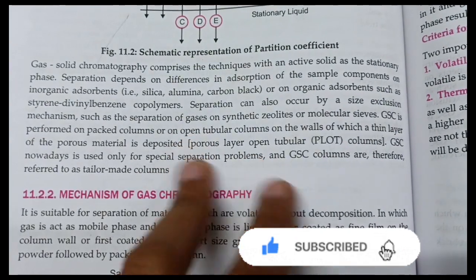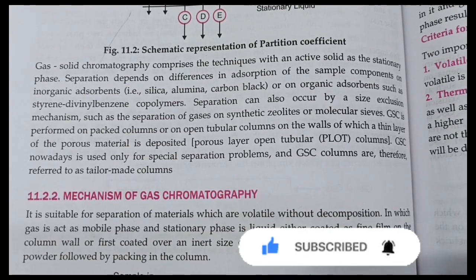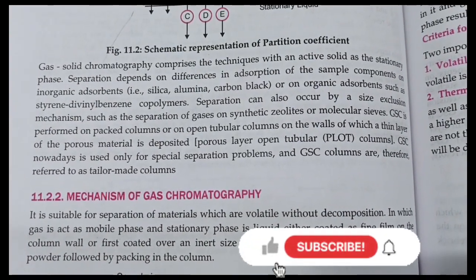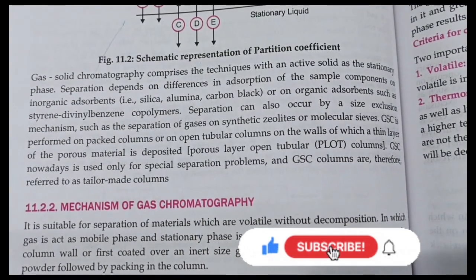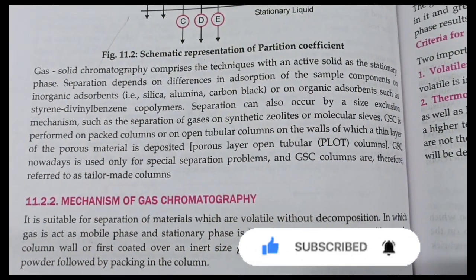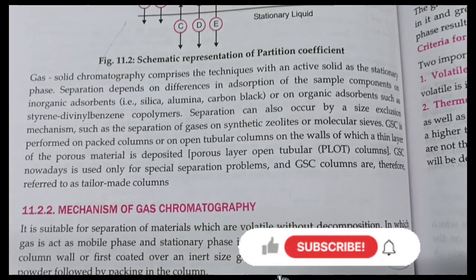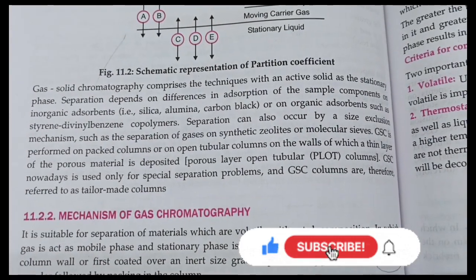Gas solid chromatography is performed on a packed column or an open tubular column, on the wall of which a thin layer of porous material is deposited. Nowadays gas solid chromatography is used only for special separation problems. The gas solid columns are therefore referred to as tailor-made columns.